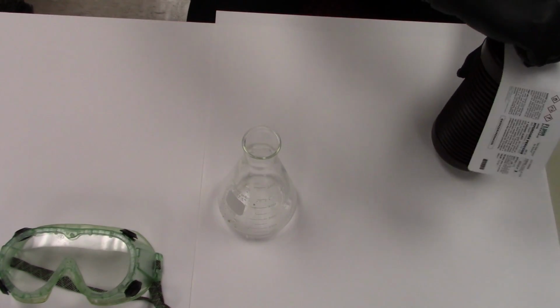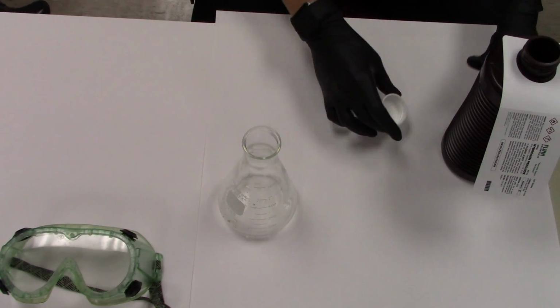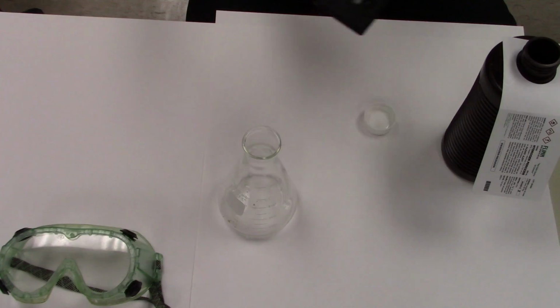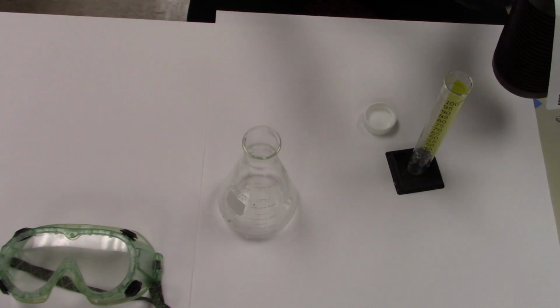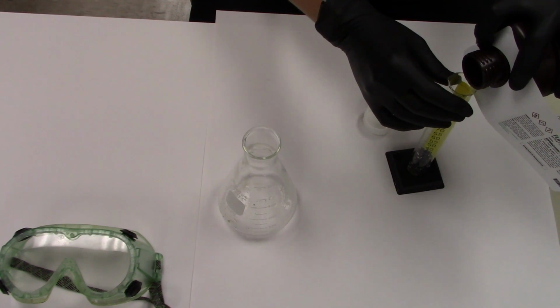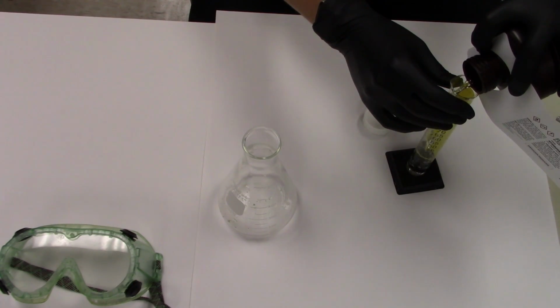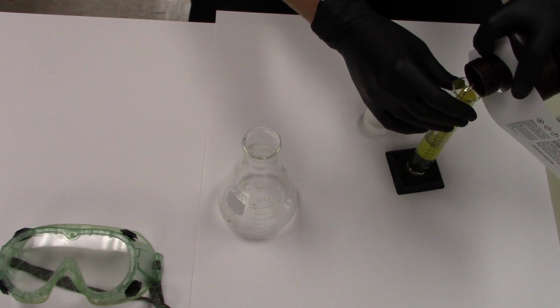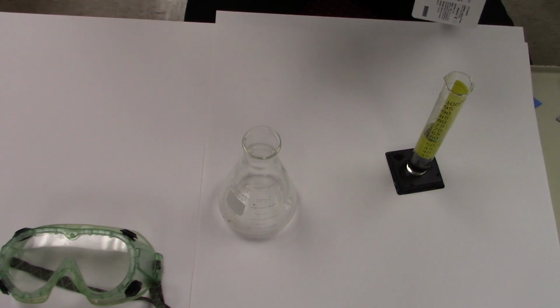So this is hydrogen peroxide. What do you use hydrogen peroxide for? Clean out a sore, and it doesn't feel very good, does it? Now the hydrogen peroxide you would use for that is only like 3% concentrated. This is 30%. So if this touched your bare skin, it would start to eat away at your cell membranes. It would oxidize and bleach your tissues. It'd be really bad. It's almost like an acid in that sense, but it's not a very strong acid.